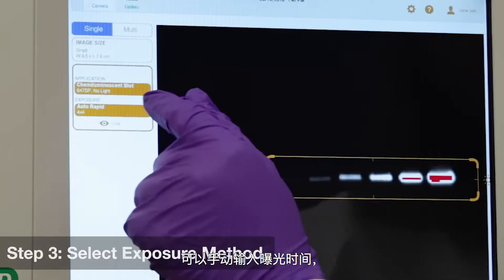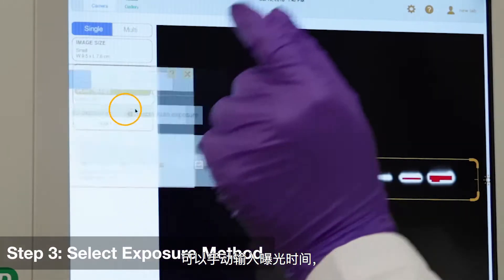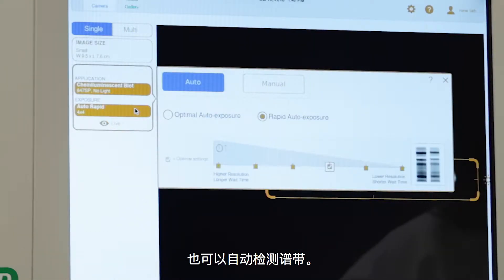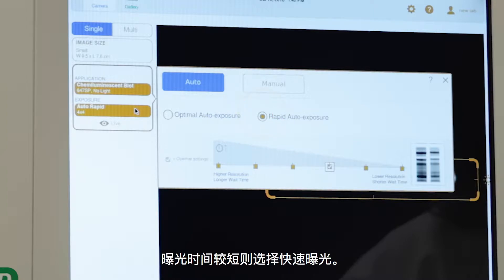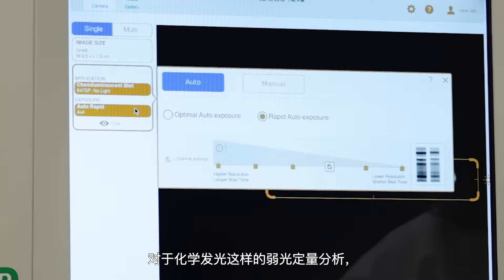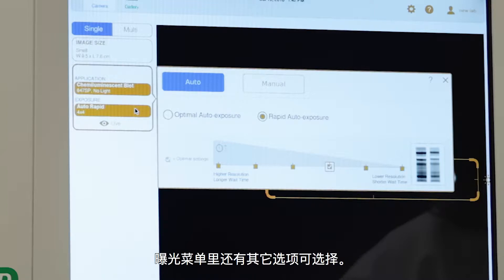You may choose between entering your exposure time or detecting your bands automatically. Use optimal exposure to benefit from the full dynamic range of the instrument. Use rapid exposure for shorter exposure times. For low-light, quantitative assays like chemiluminescence, additional options are available in the exposure menu.